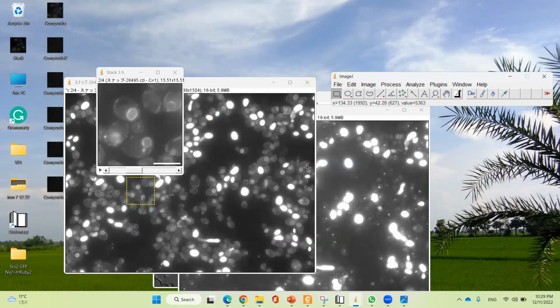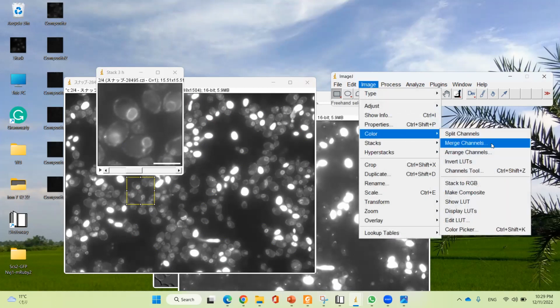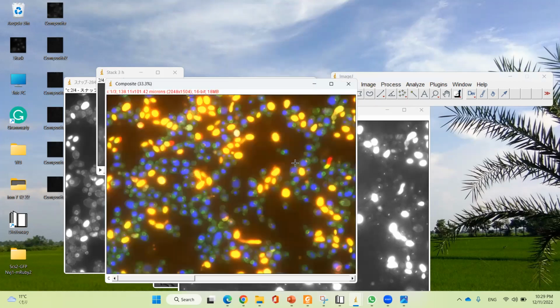And so finally I'm going to merge 3 colors, red, blue and green. So red is 2, green is 1, blue is 0. Click on OK.